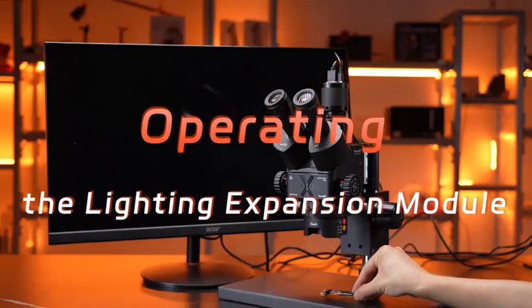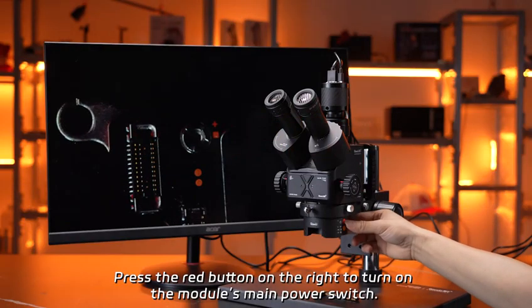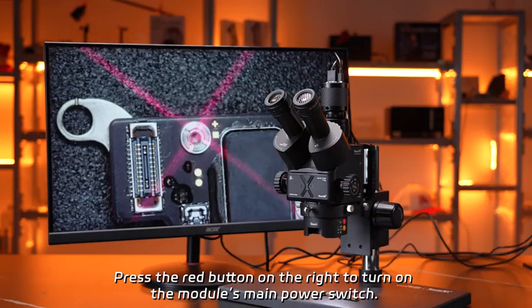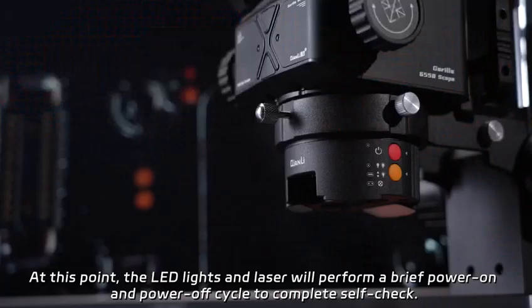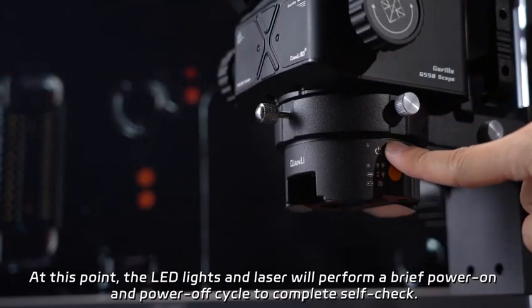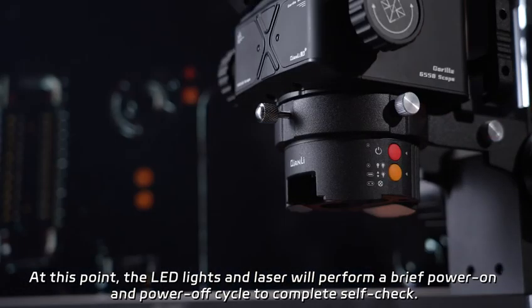Operating the lighting expansion module, press the red button on the right to turn on the module's main power switch. At this point, the LED lights and laser will perform a brief power on and power off cycle to complete self-check.